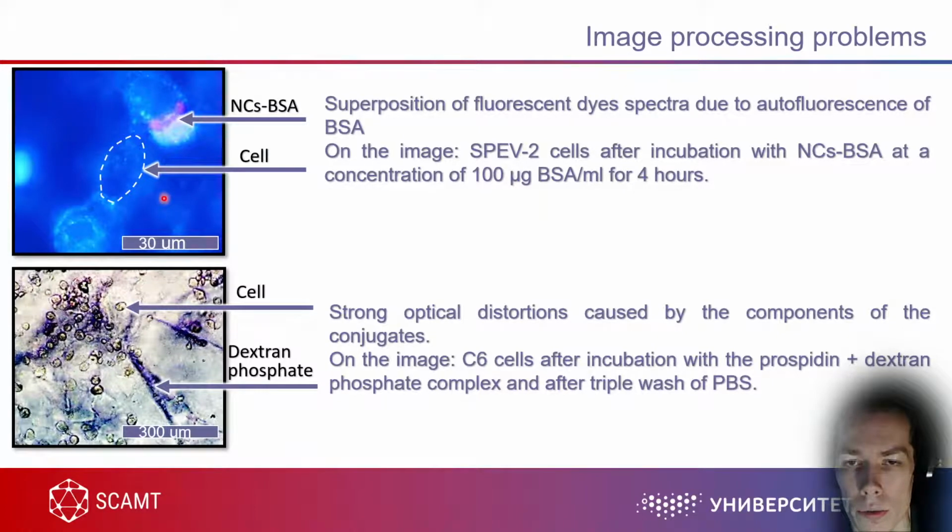And this is a very good question. When you stain something, you need to observe your images and your samples very accurately, because you need to understand what you are really seeing.